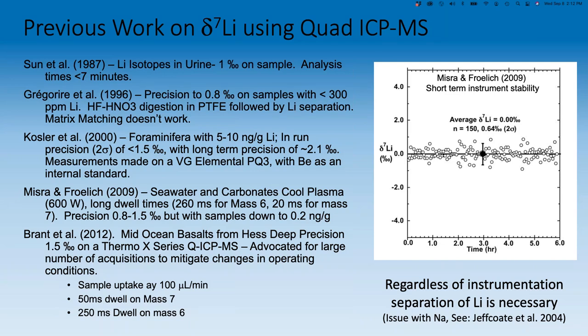Yeah, and the self aspiration is exactly where we were going next. We haven't gotten there yet. Obviously things have been a little slow, and I can't have the machine just running lithium 24/7. There's other stuff that our lab has to do. But yeah, no, I agree. I think self aspiration, especially through Teflon tubing, is probably a better way to go to improve precision.